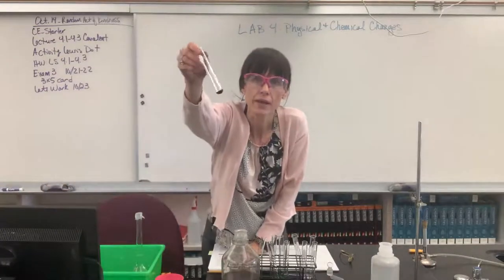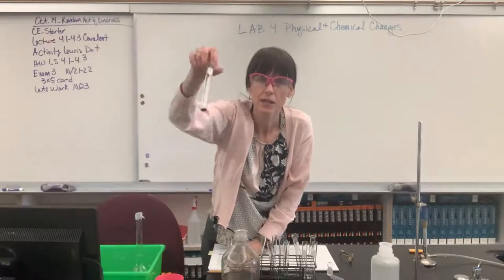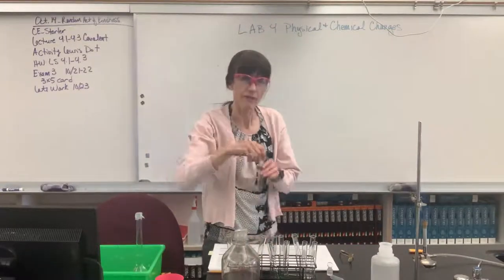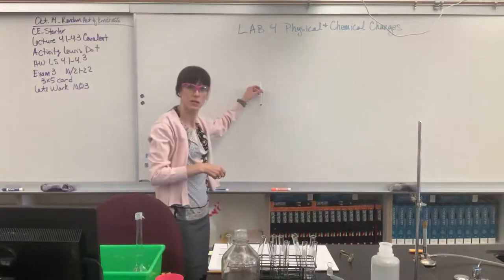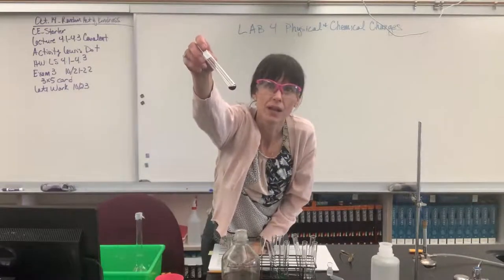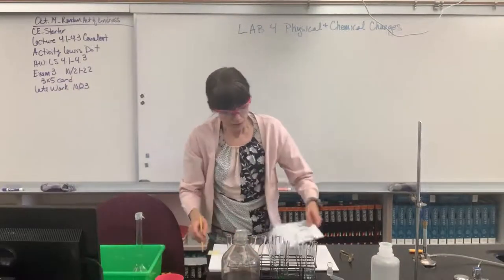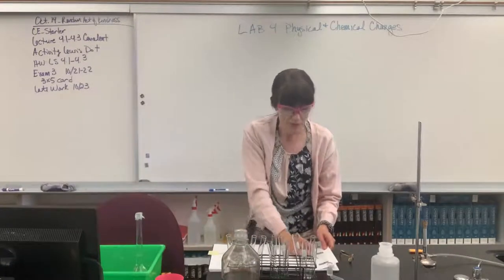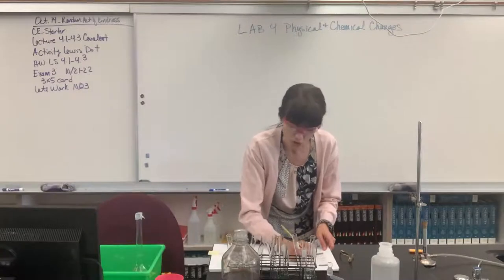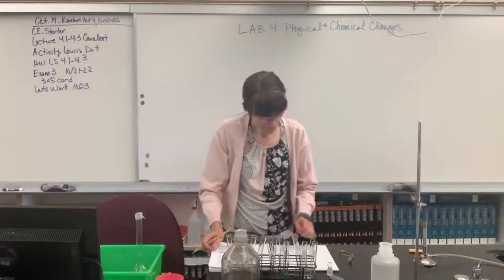That is a brilliant red. That is like a burgundy deep red. Can you see it against my shirt maybe? It's a red color, deep red. If I did it against the board, could you see that? No, it's a little bit hard to see from that distance. That is a red color. So let's write that down. Pretty neat, wow. So if I come back to page 54 where it says result of adding NH4SCN, deep red. It's a dark red color. Pretty cool. Whew, nice. Okay.